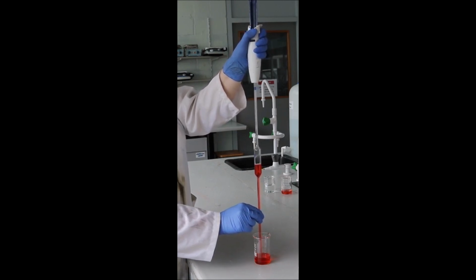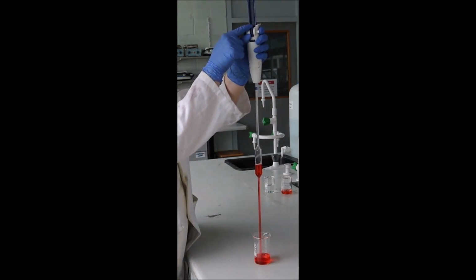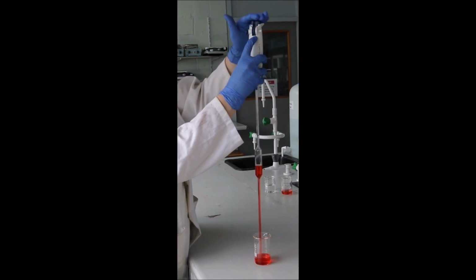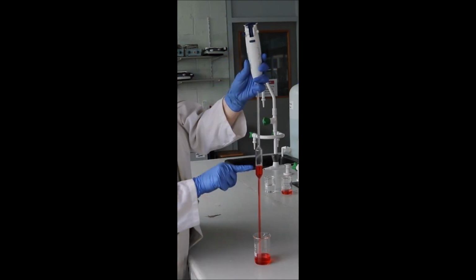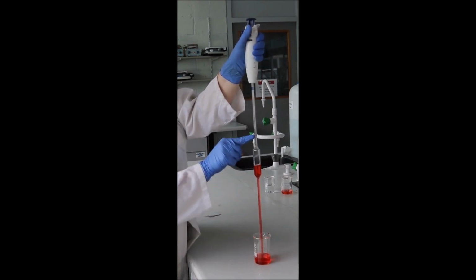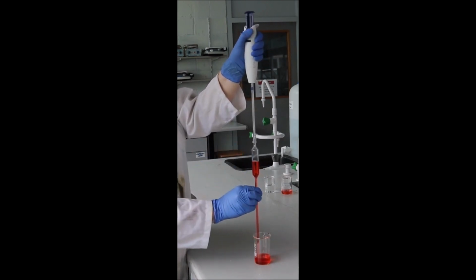At this point my plunger has reached the top and I can't turn the wheel to continue filling. Notice how I press the button under the wheel which allows me to depress the plunger without emptying my pipette completely, and I can now continue filling my pipette to the calibration mark.